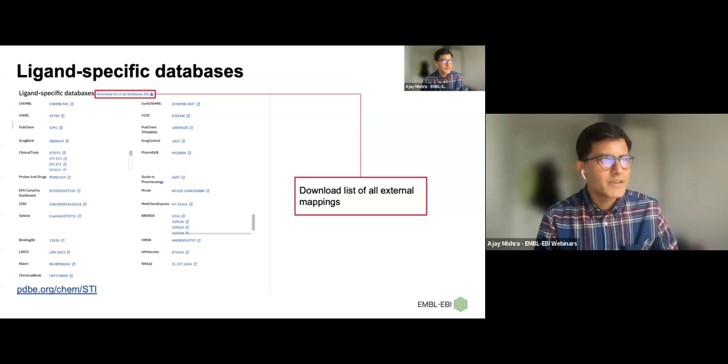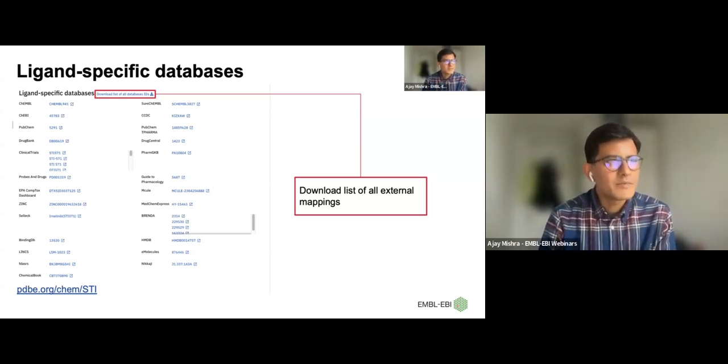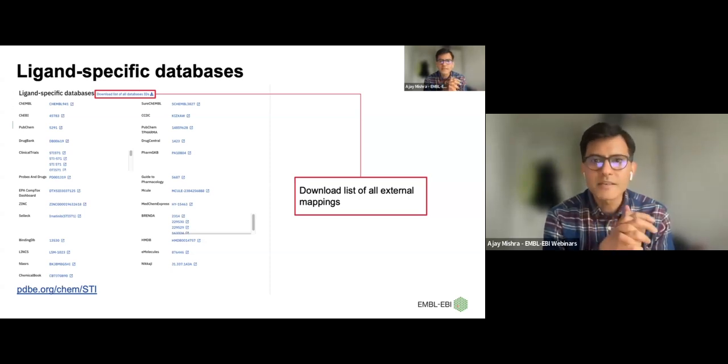Right. So the next question, I think if I can rephrase: is there information available on this page about protein ligand docking analysis so that a person can find where the ligand is binding exactly, to what residue in the protein structure?